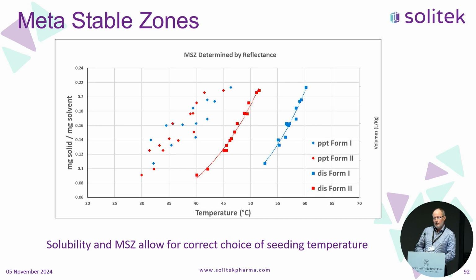Slow, controlled heating and controlled cooling. And what do we see? Well, we're heating, so we're starting at low temperature and we're going up here. If we consider form 1, which is shown in blue, then we're going to go through the solubility curve and see dissolution. And by performing the different concentrations, we can quickly plot our solubility curve.